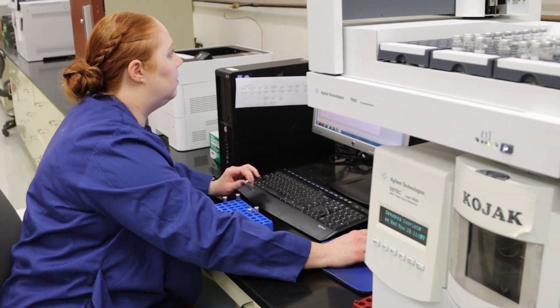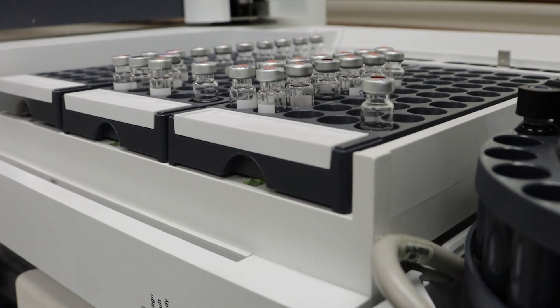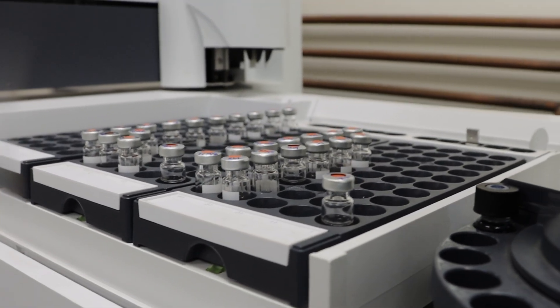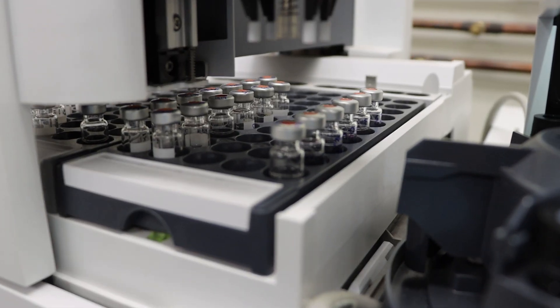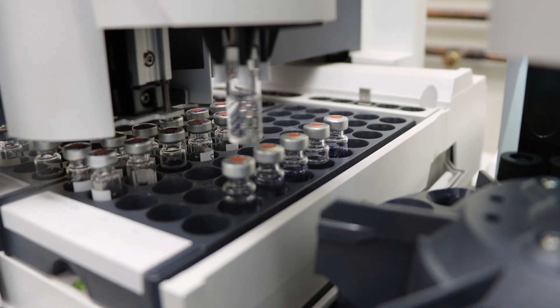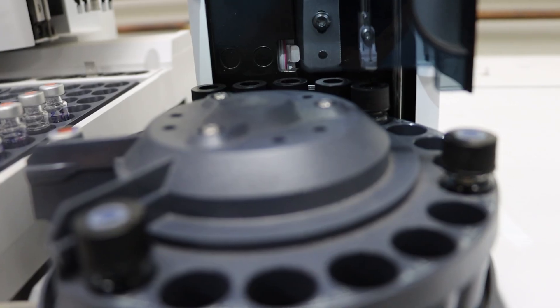We use a gas chromatograph mass spectrometer for our analysis, abbreviated to GC-MS. It's a two-part instrument with the GC portion, the gas chromatograph portion, being where it separates compounds based on their polarity and their interaction with the column. It pushes it through a column and separates them based on size and polarity.